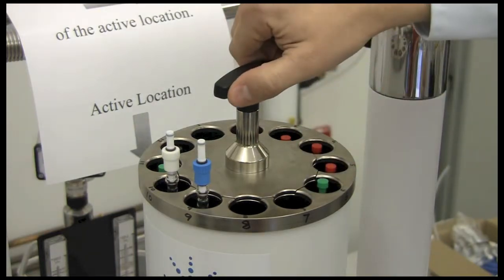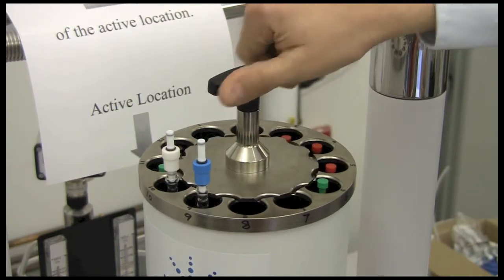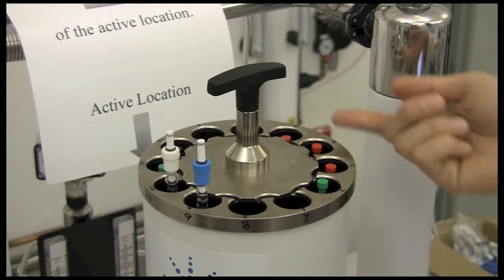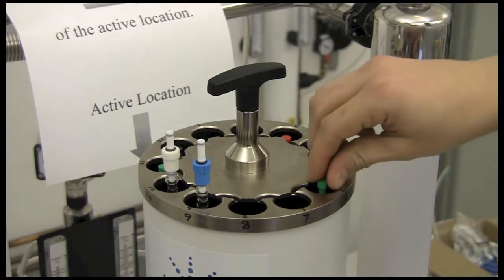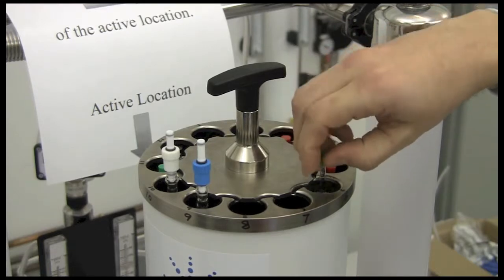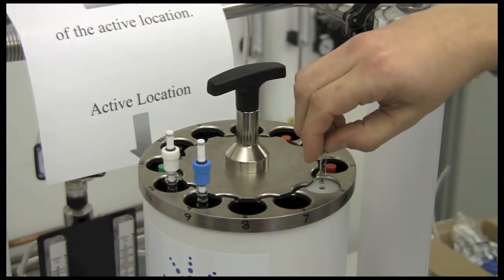Then you should return the carousel back to the locked position or the capture position. The reason for the capture position is that sometimes when the sample ejects, it can either pop up too far or it will bounce up and down, and this tab prevents it from doing that.